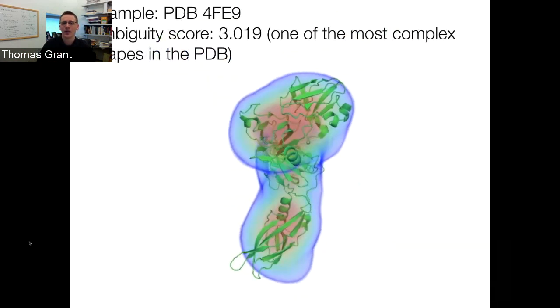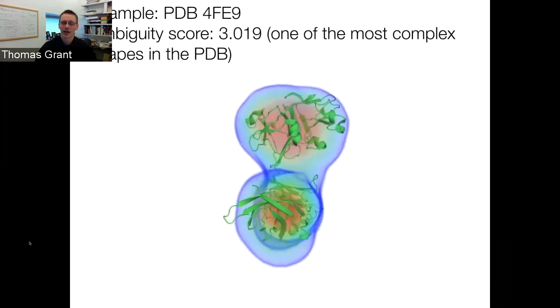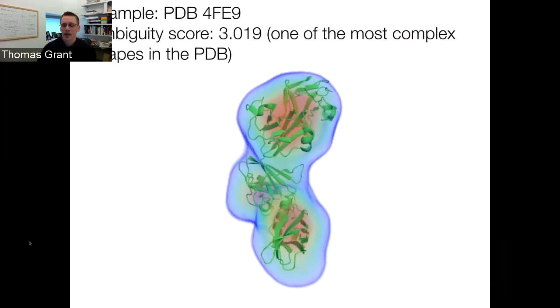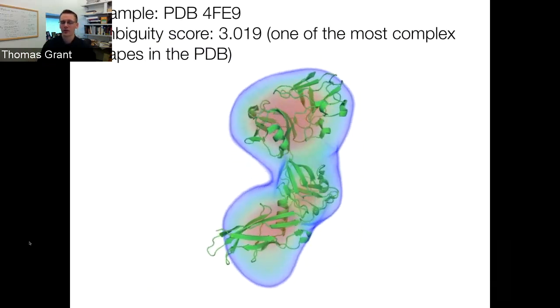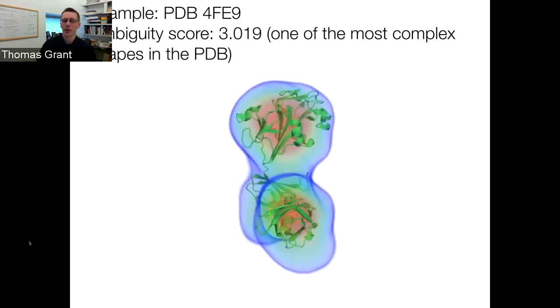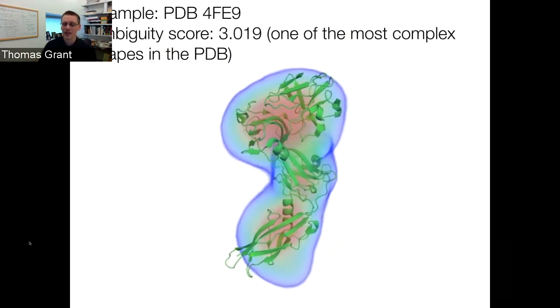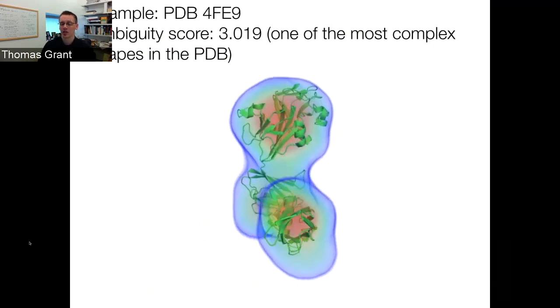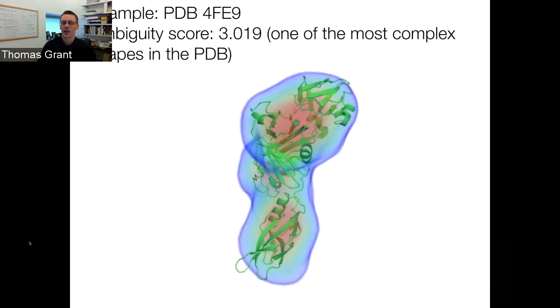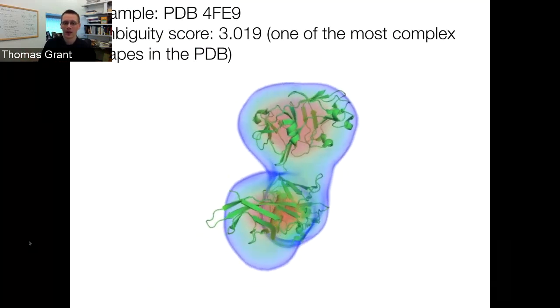This was a good example of the problem of enantiomer selection in SAXS. One problem in SAXS is that different enantiomers, or different mirror images of a particle, will have the same exact scattering profile. And so when you run DENSS, you actually have to do some kind of enantiomer selection when you're doing the averaging, because otherwise you'll average out left and right-handed reconstructions.